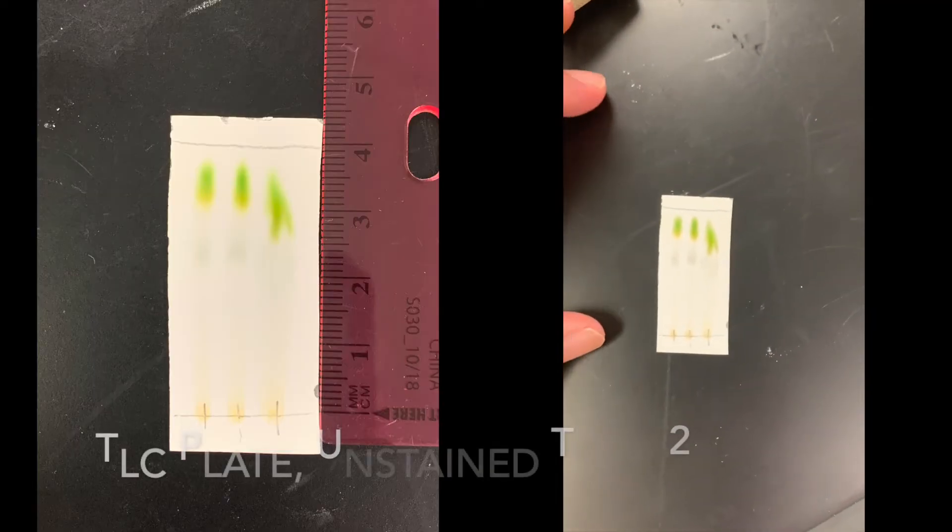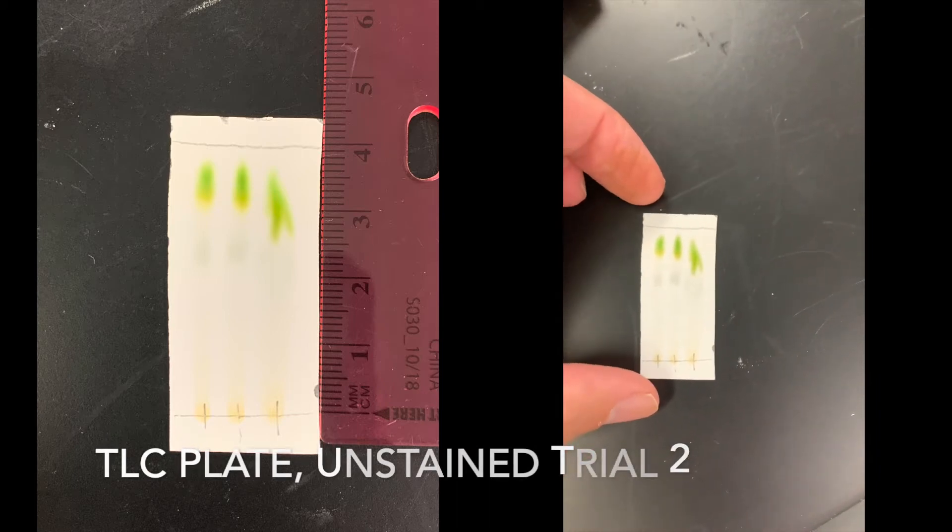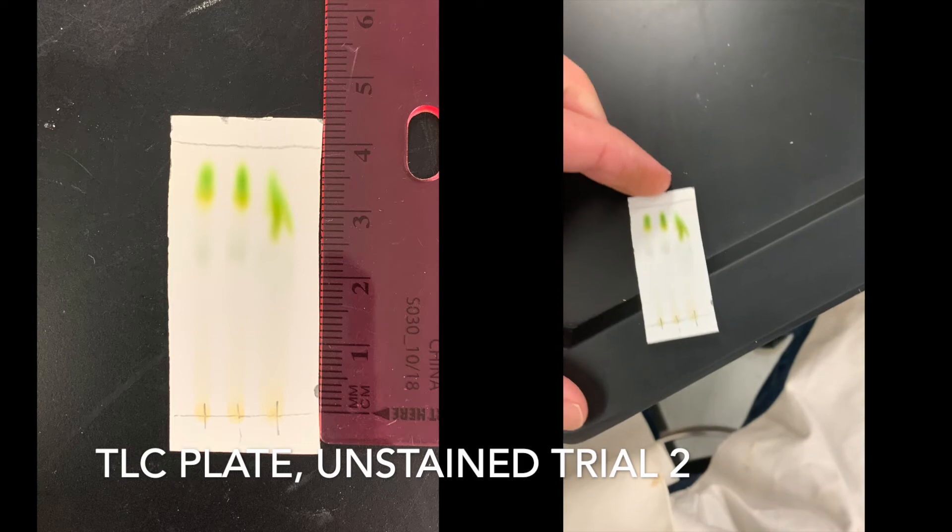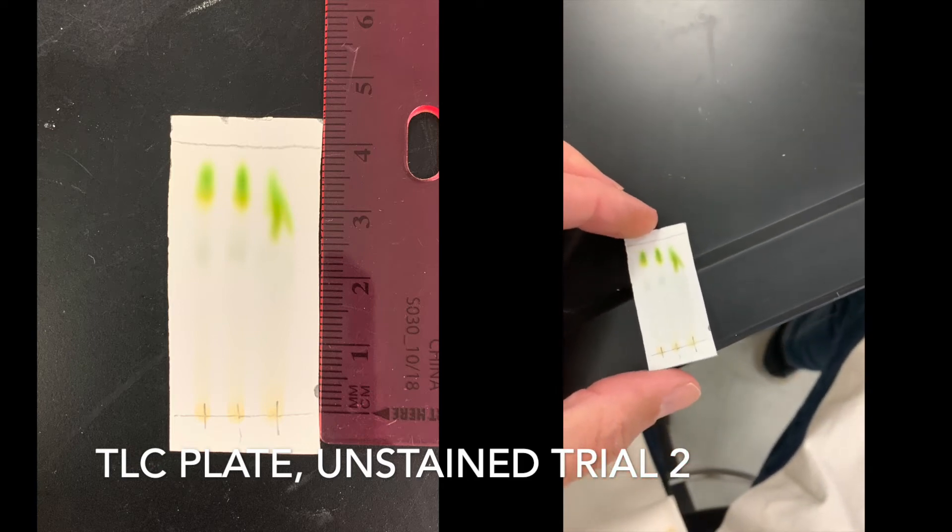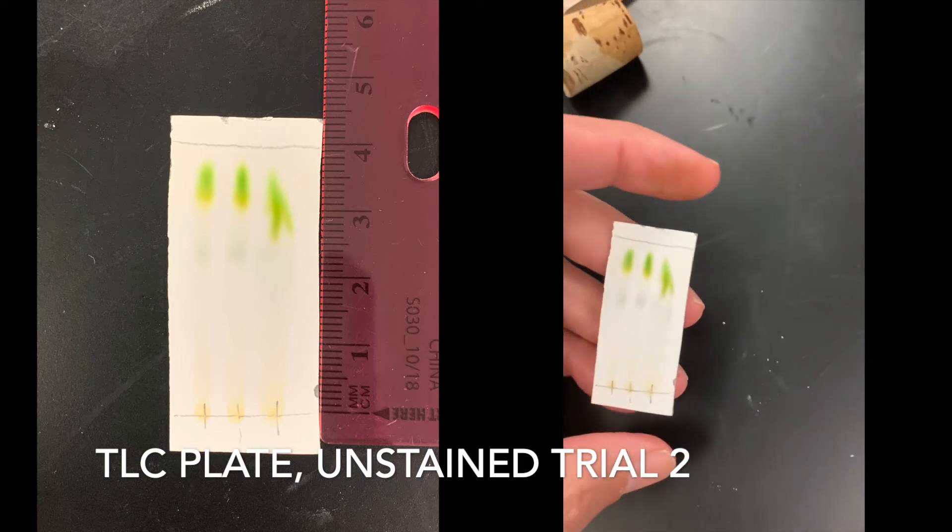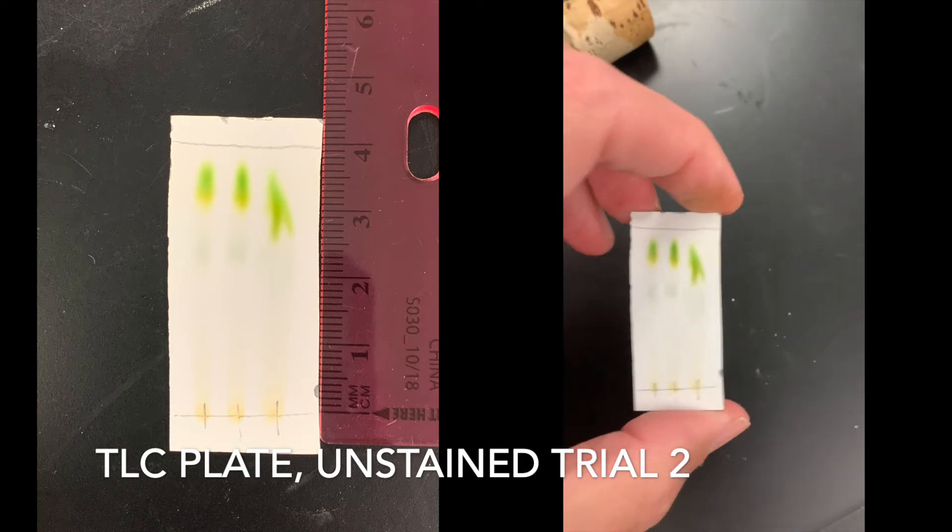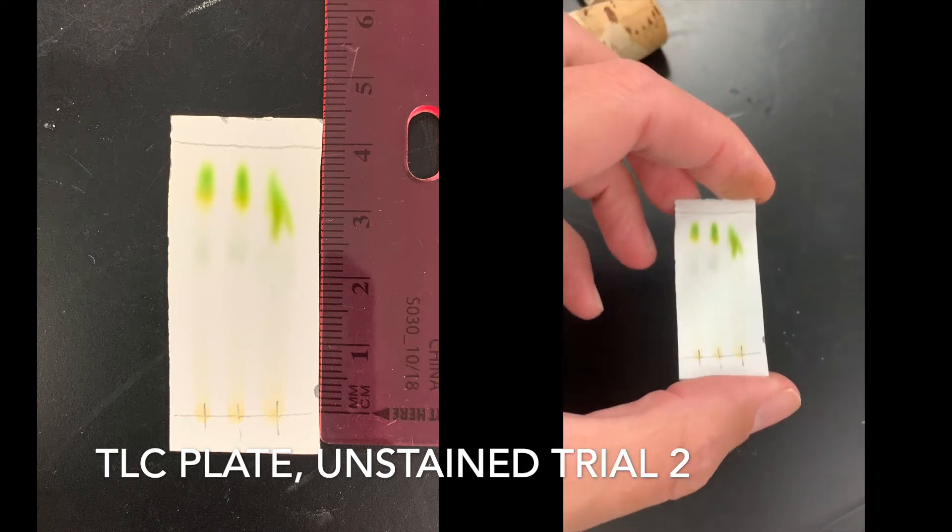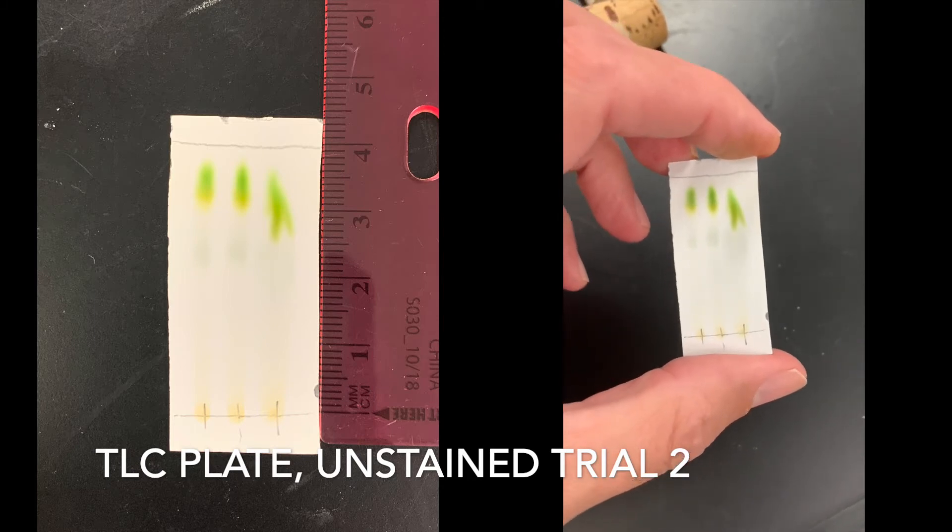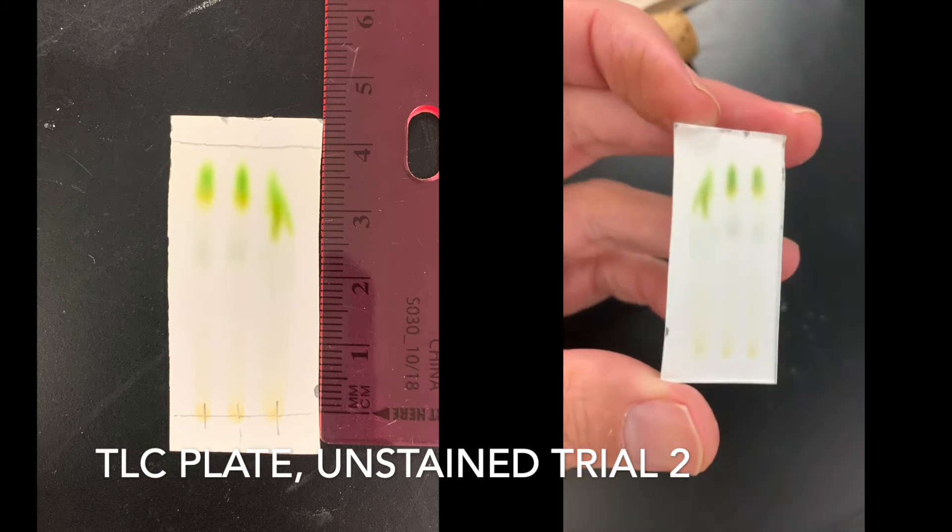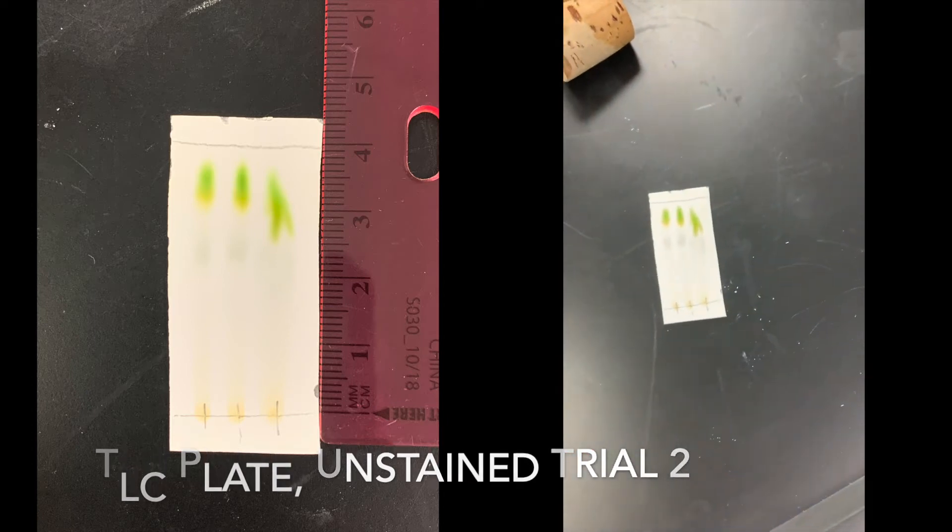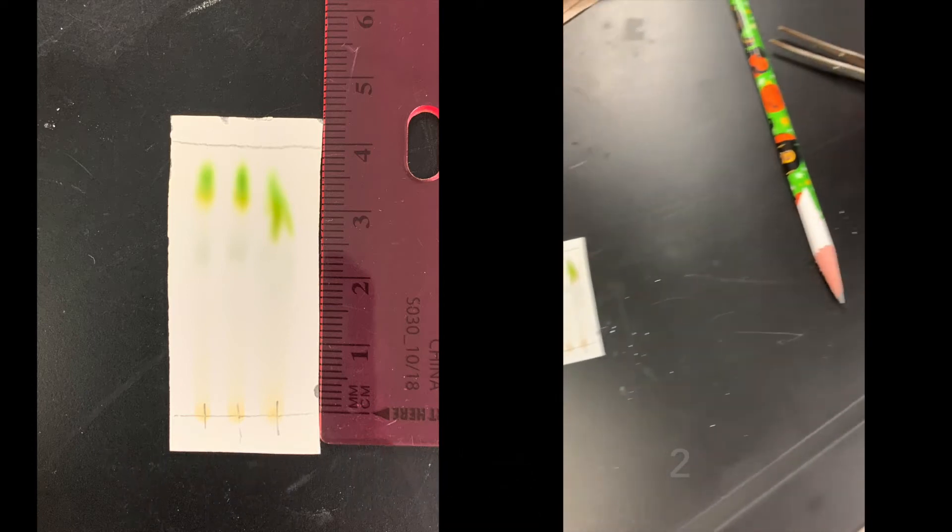Okay, this is trial two. I just wanted to show you an image here, a video here of the TLC plate. And always, you want to hold this by the edges. So you got some green and yellow colors, maybe another kind of a colored compound in the middle and on the baseline as well. So if we look at it on the back, it looks kind of like that. I'll go ahead and take a picture now and post this.